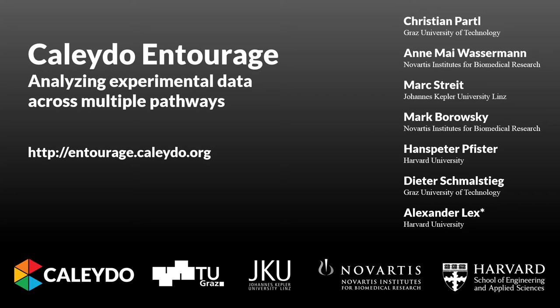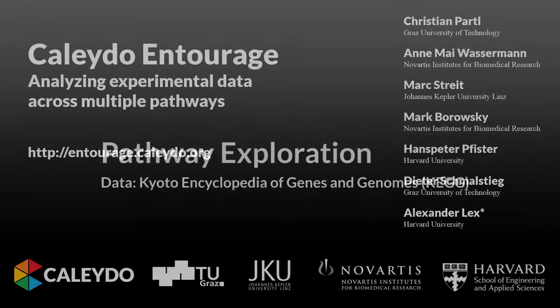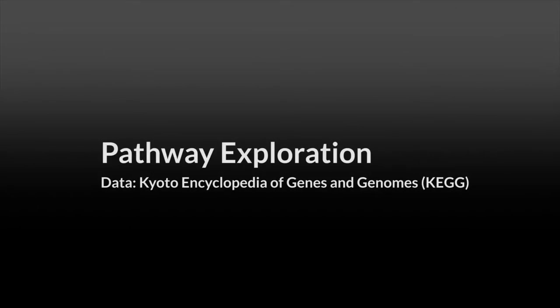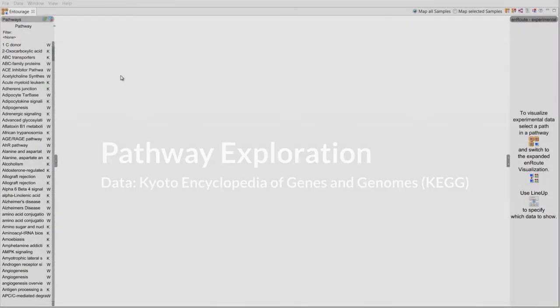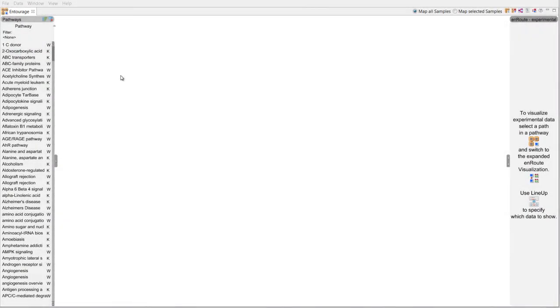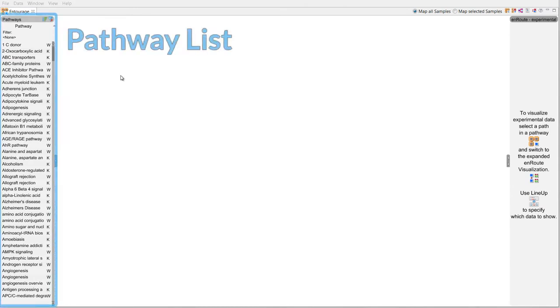Kaleido Entourage is a visual analysis tool for the exploration of relationships between multiple biological pathways and associated experimental data. To start the analysis we choose an initial pathway from a list.